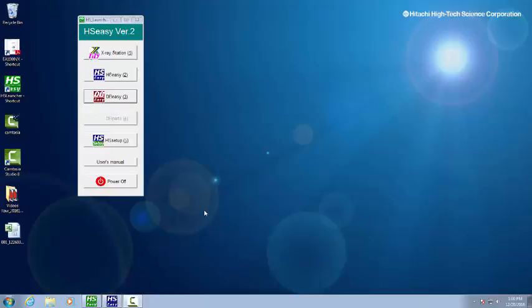Let's say we've been taking measurements all day, finished our lot of samples, and we want to view the report data either right away or in two years from now when something comes in question. Every measurement that's taken on this system is automatically saved in the database. It is required to be saved in the database. You cannot corrupt it.